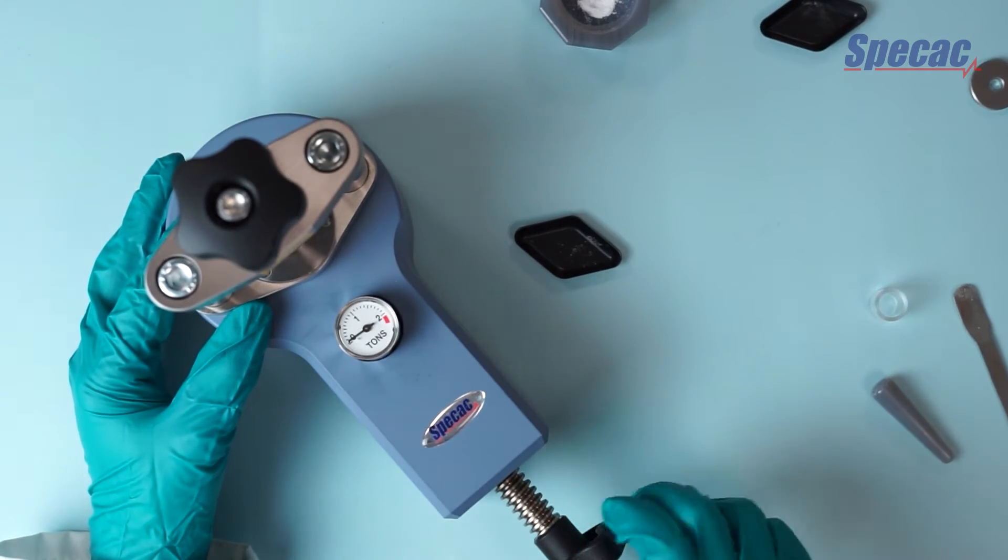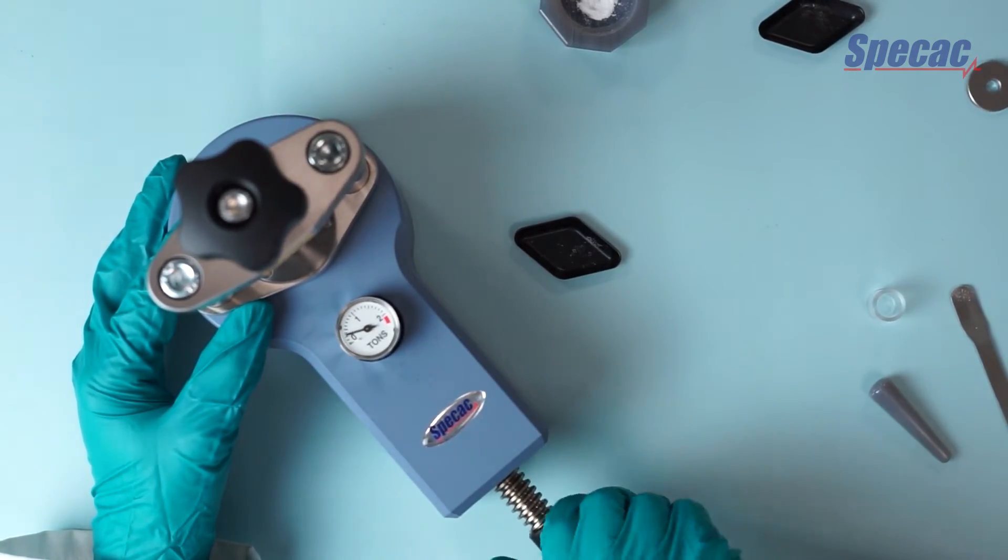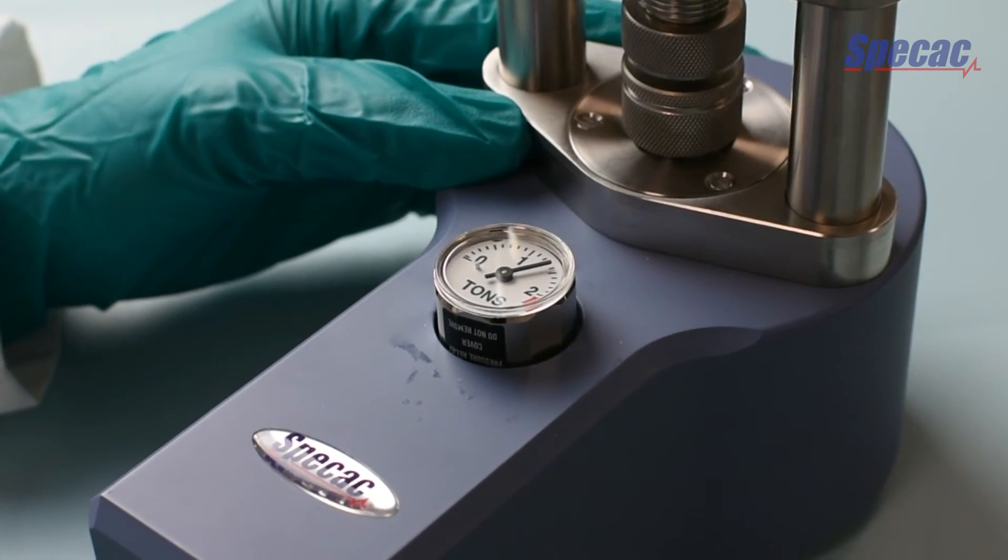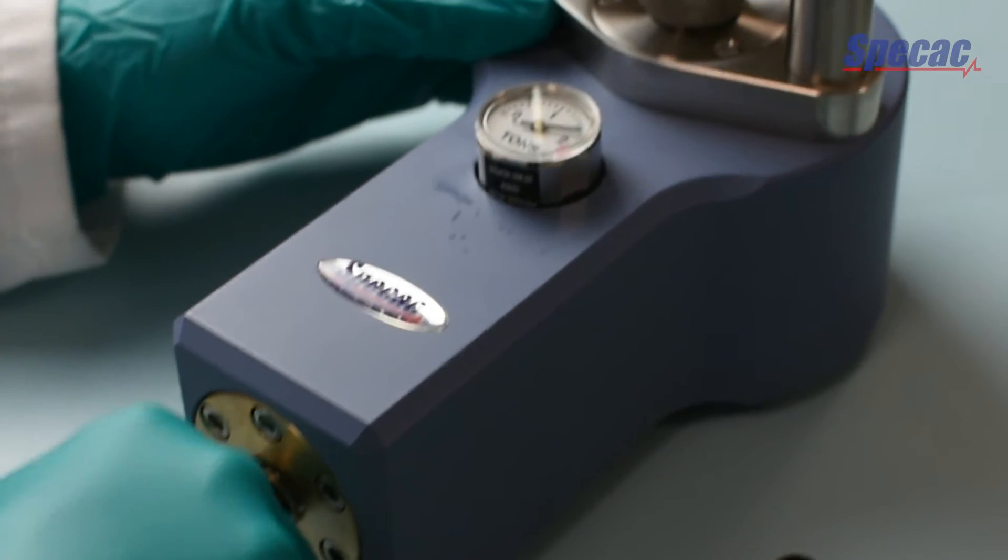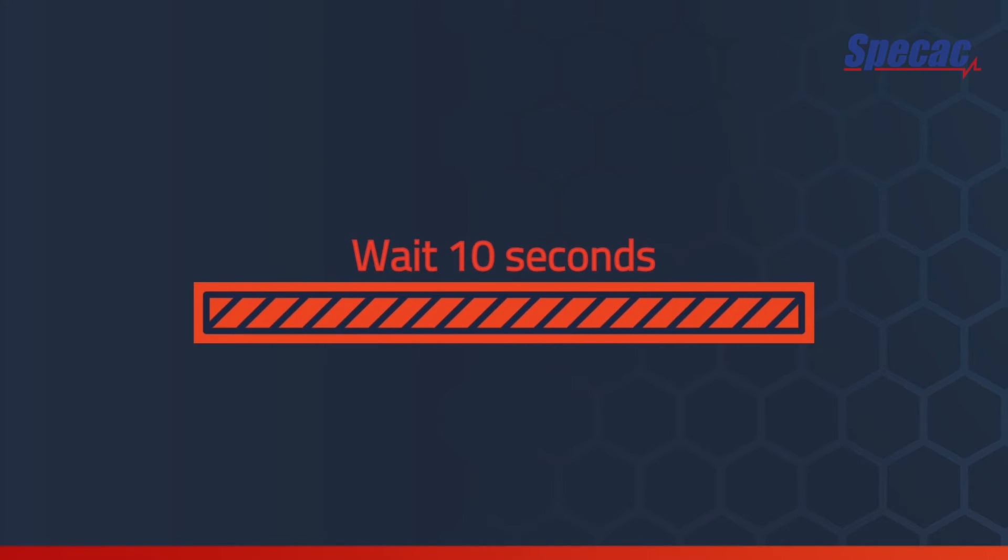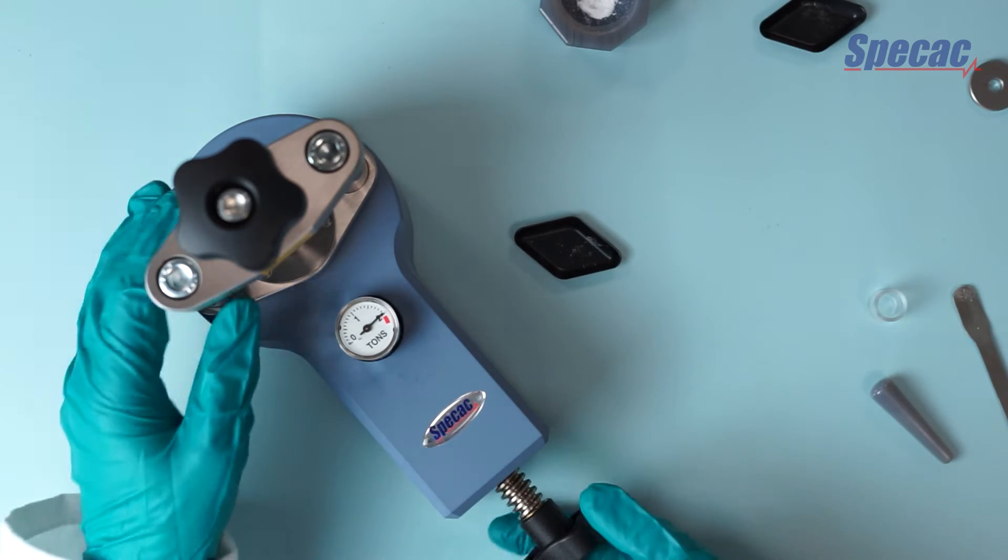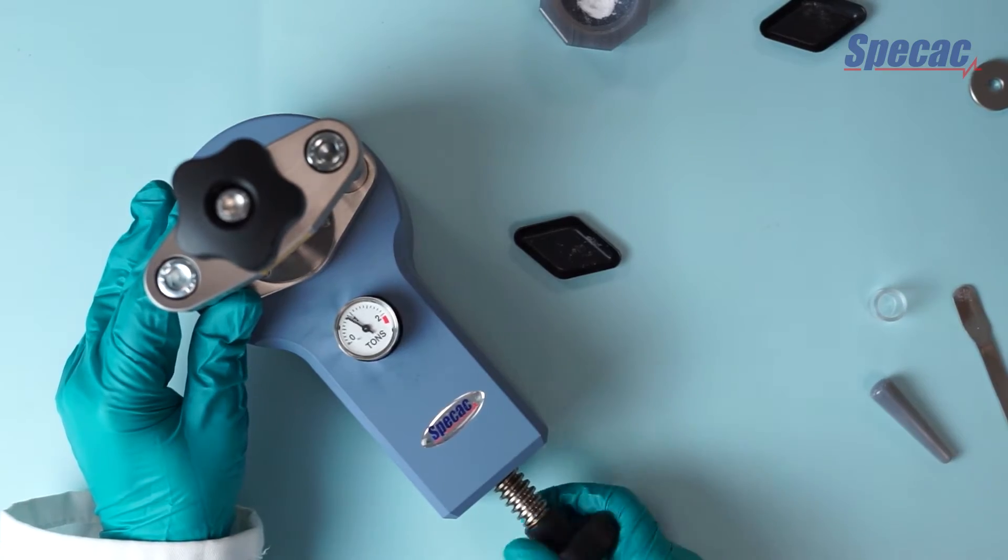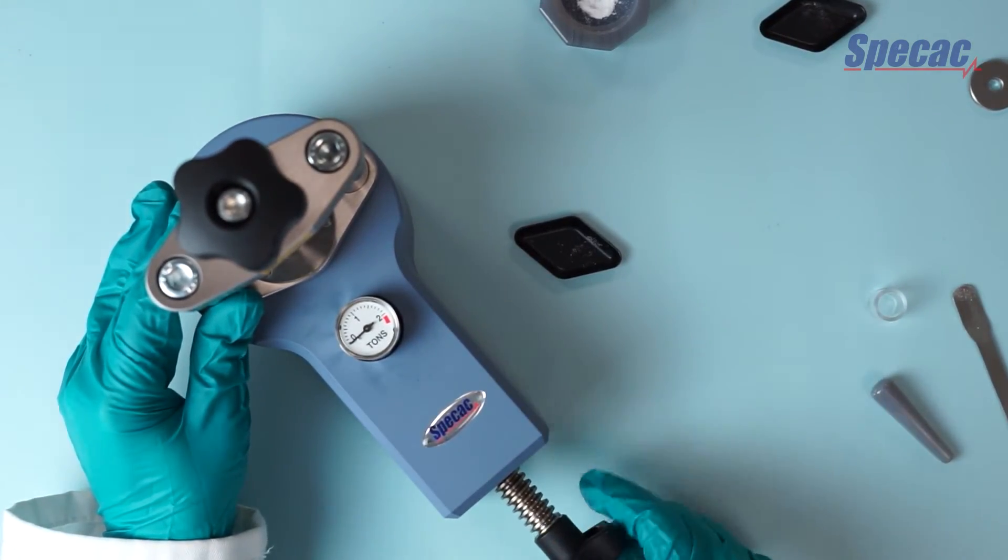Then we use the screw on the front to apply a load of two tonnes, rotating the screw clockwise to increase the load. And then we wait a few seconds. When we're ready we can relax the load by turning the handle counterclockwise. The load comes back down to zero.